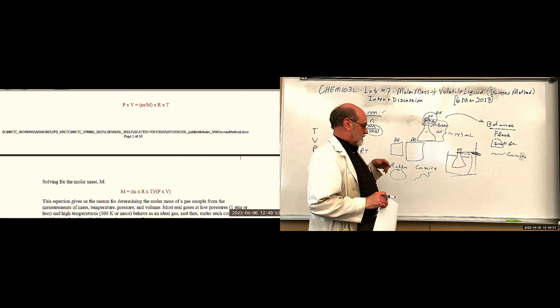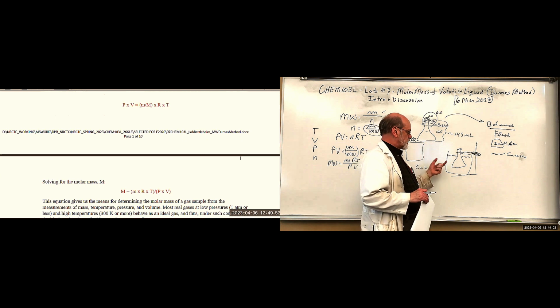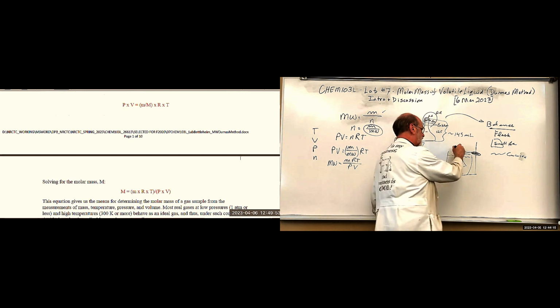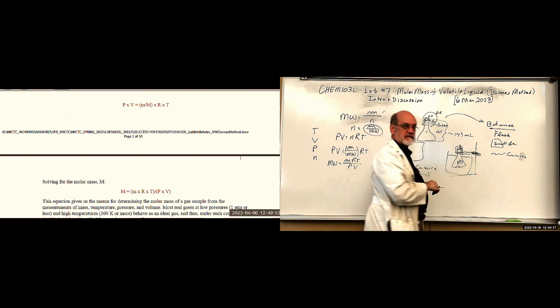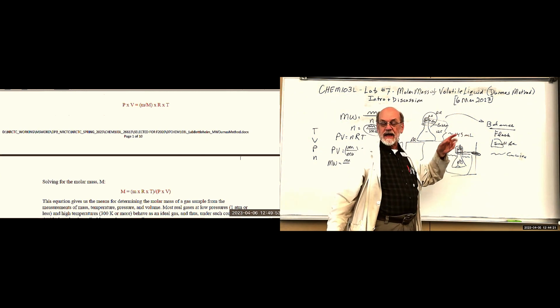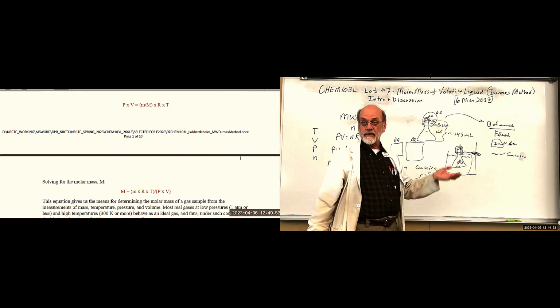So once you vaporize the liquid, you got this one here and you got the big one here, you got a liquid down here, and it's going to vaporize into a gas. And you got a pinhole punched in the top of it to let the vapors out. And it also drives out any air that's in there.